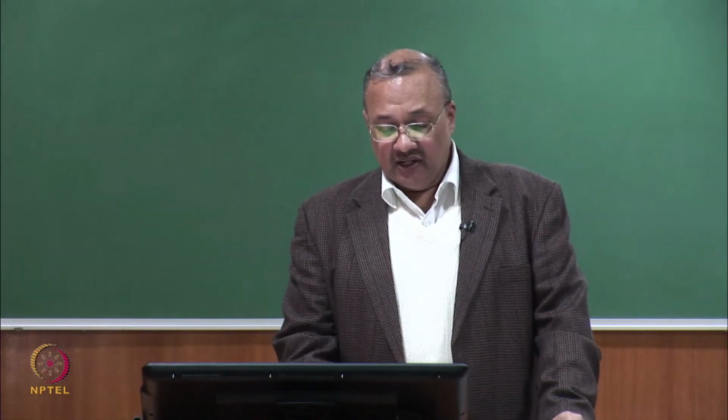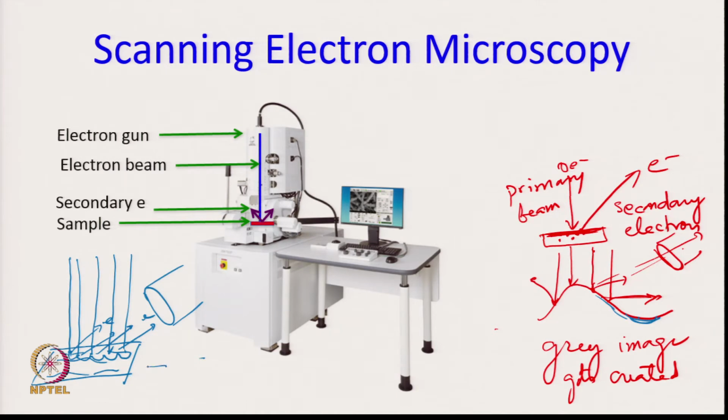Now, if we take a sample, say a carbon sample, like this textile sample which is made mostly of carbon, hydrocarbons: carbon, oxygen, maybe nitrogen to some extent. This is something which does not have too many electrons, right? So, I will not get a very strong signal. Plus, as these electrons come and hit the sample, some of them stay on the sample and this sample will get charged. So, you will have a lot of negative charge on the sample.